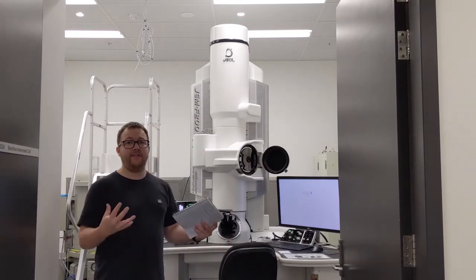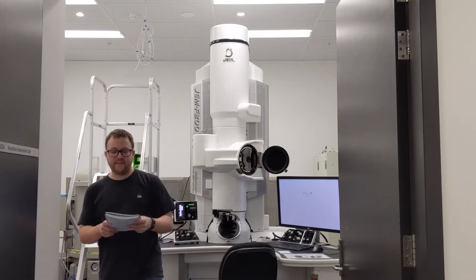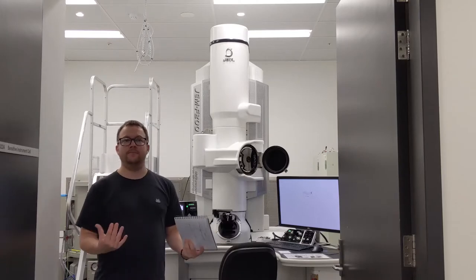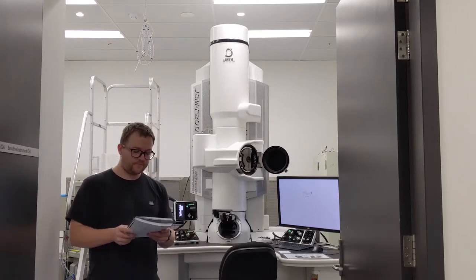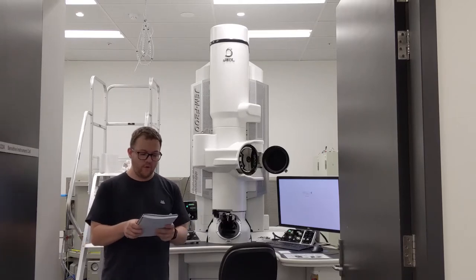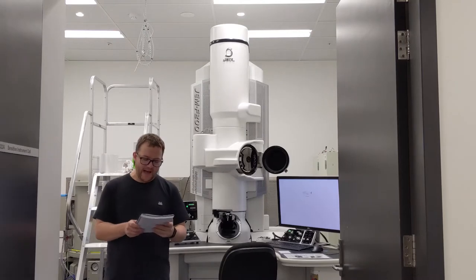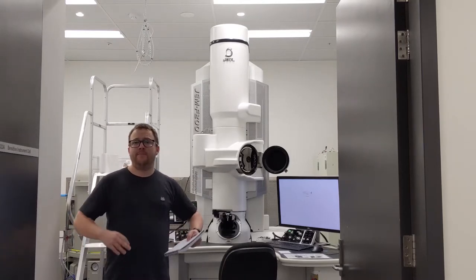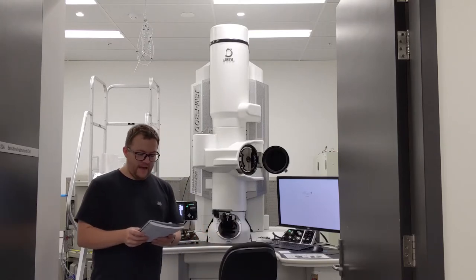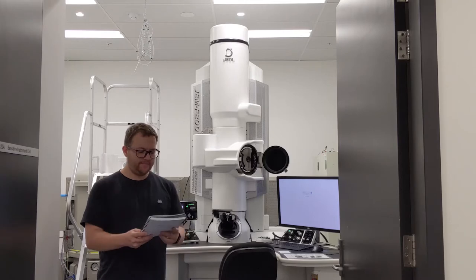After that scattering has occurred, we have the objective lens, which is about here. This takes the scattered electrons and the unscattered electrons and focuses them all into an image of our sample. So this is the first point that we get to see the sample. However, this is a really small size, so we need some magnification lenses, which are this bulk here. These can magnify that small image from 50 times to 2 million times magnification. And at 2 million times magnification, we can start to see the atomic structure of the material we're looking at.